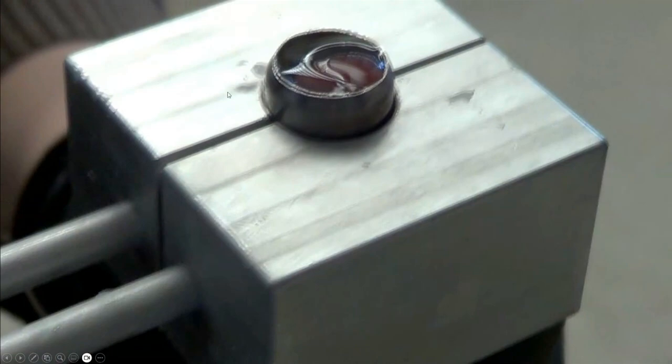Okay, so Precisionary provides a cooling tool here to expedite the chilling and solidification of the agar. We will put the cooling tool on for maybe a minute or so to expedite the chilling, and we'll have a nice solidified agar inside the cylinder with the inflated tissue inside, and it will be ready for cutting.